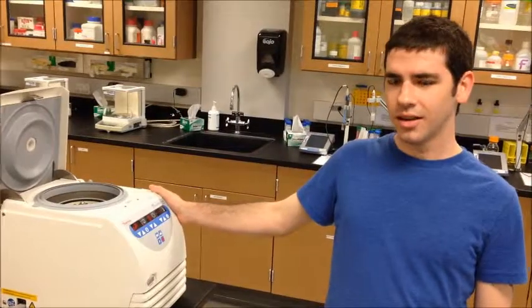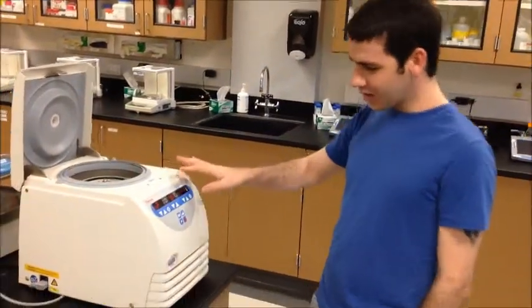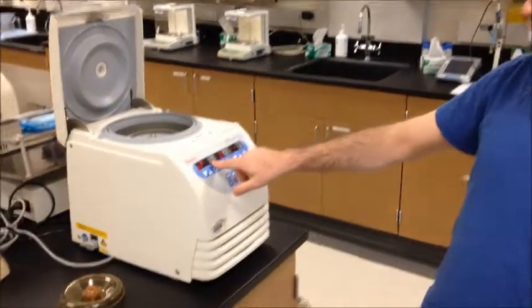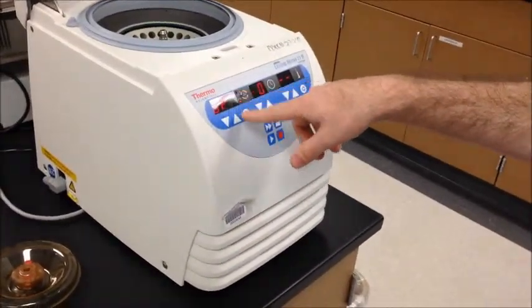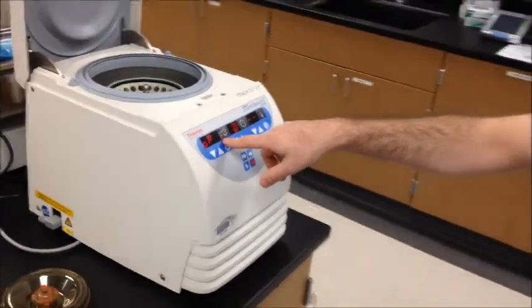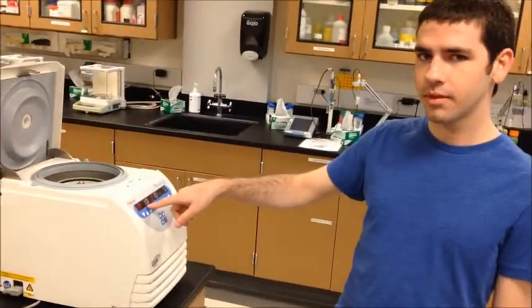Exactly. So, wait up a second. I see on here you have an option. You have either times g or RPM. What if you only have one? What if you only have times g, and the formula we have for this is RPM? What would you do then?